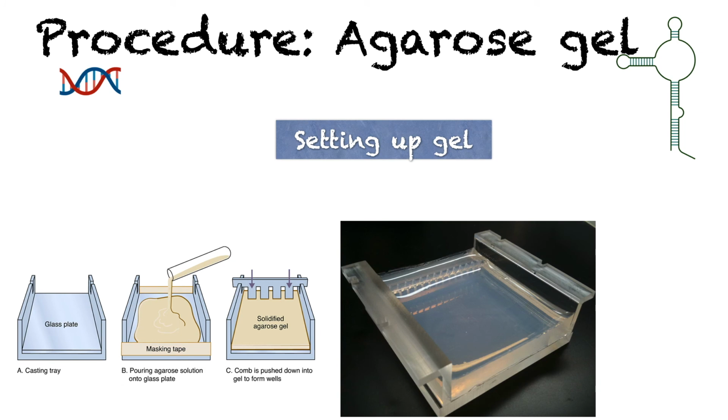Usually in biotechnology, SDS-PAGE gel is used to separate or denature protein molecules. In some cases, we use SDS-PAGE gel to separate RNA or DNA molecules as well, but generally it is used for separating protein molecules. And another one is agarose gel, which is commonly used for separating DNA and RNA molecules.